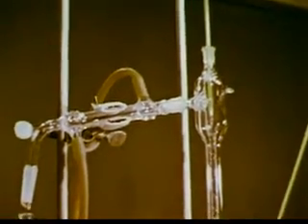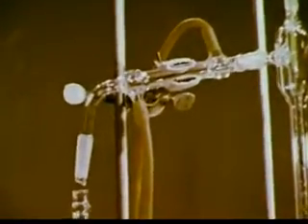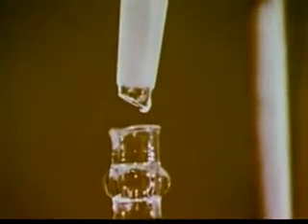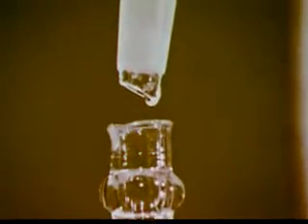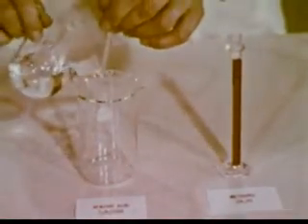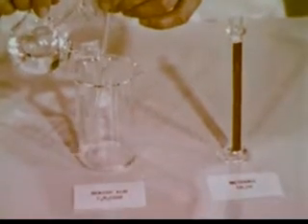Under these conditions, a colorless liquid condenses and collects in a graduated cylinder. The boiling point and other properties prove that it is methanol. The other product, which we will find to be benzoic acid, is still in the hydroxide solution.